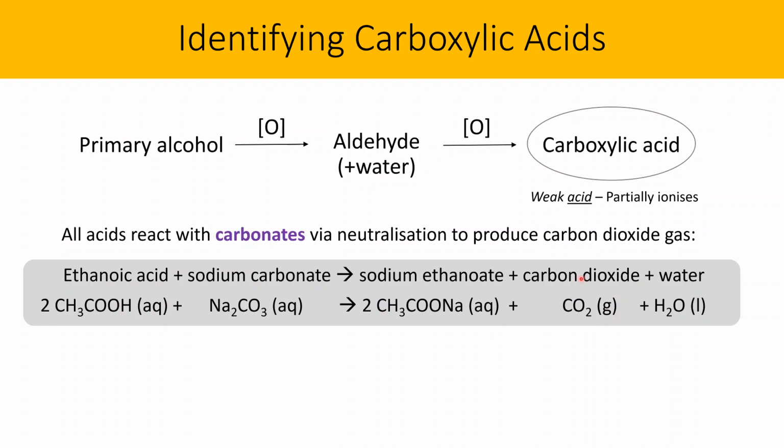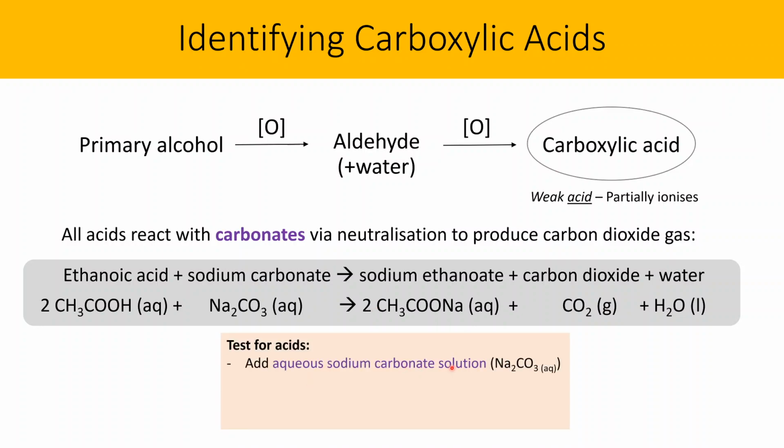Now this carbon dioxide is the key to this test, because I must insist this is the test for carboxylic acids. We add aqueous sodium carbonate. The test for acids is aqueous sodium carbonate solution, Na2CO3 aqueous. And this gives us effervescence of carbon dioxide gas. That's what you see, that's your observation.